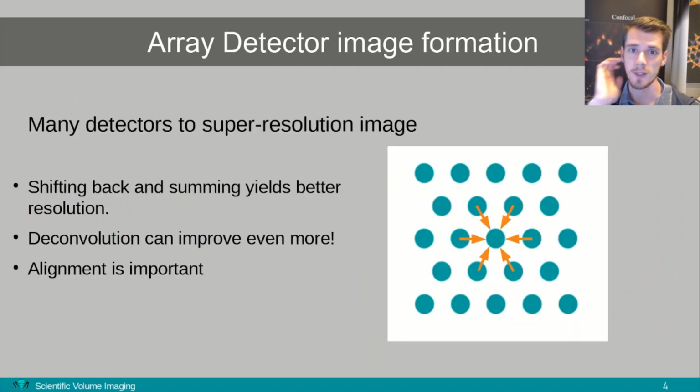Well, the detectors are often aligned to collectively obtain the light from this first Airy disk. And each of these separate detectors then acts as a smaller pinhole, collecting only a fragment of this disk, which means they independently have a sharper image, but with less signal than a regular confocal microscope image would have with one Airy disk. The differences in the positions of each detector also mean that the images will appear shifted with respect to each other.